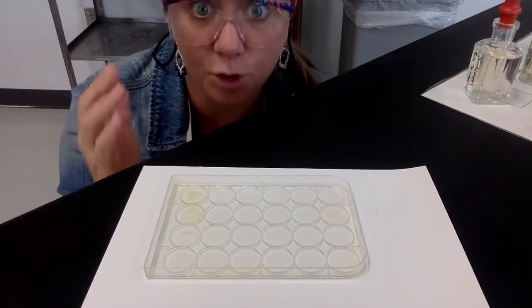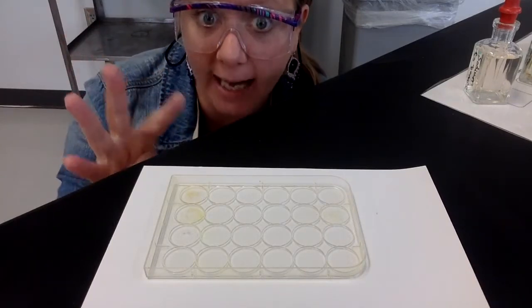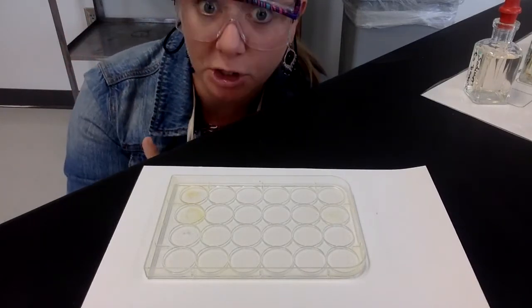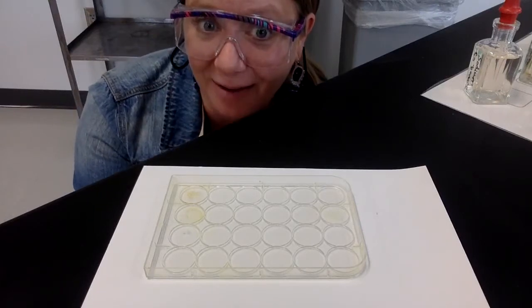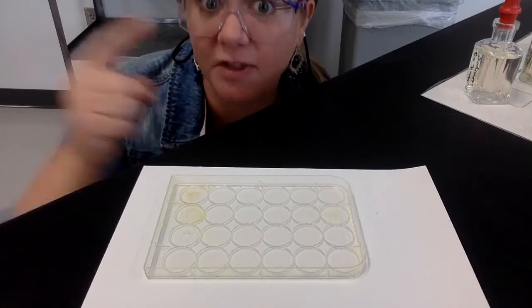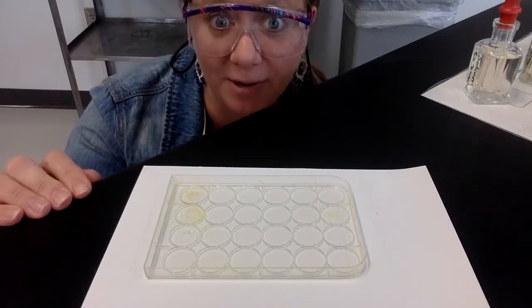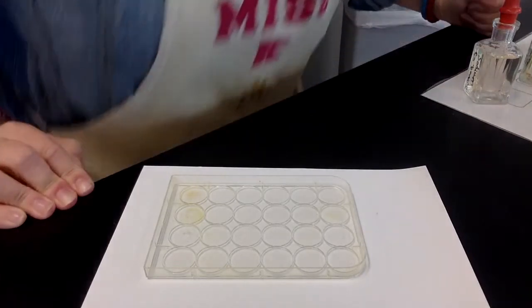And then at some point you will either pause the video and do those things that we did in the pre-lab: the 4 ions, write the compound, switch the partners, write the new compound. Anything with NO3 is always soluble. The other compound will be your precipitate. And then you'll describe the precipitate. Okay, I'm going to stand up. You won't see me anymore. Okay, so here we go.